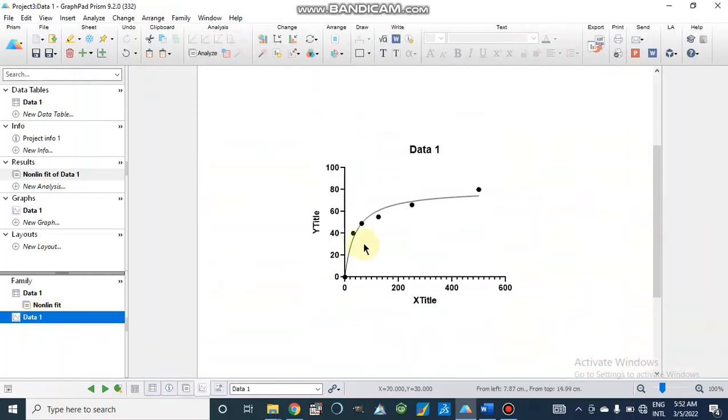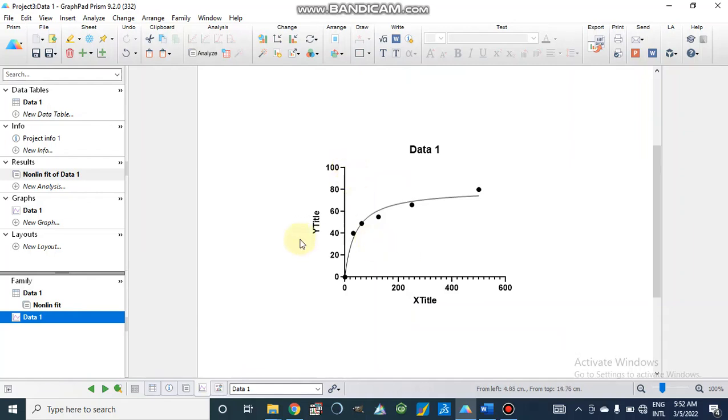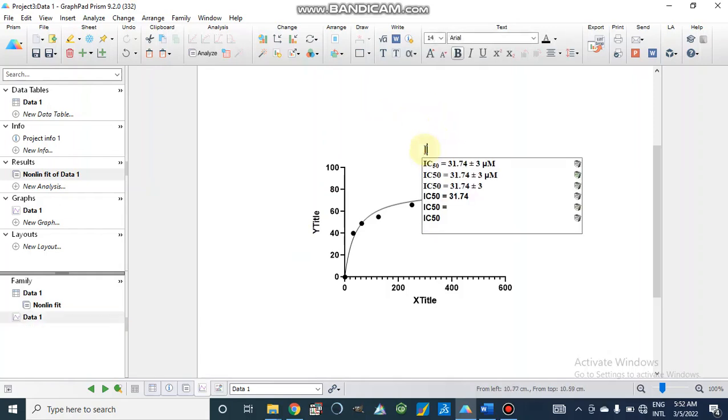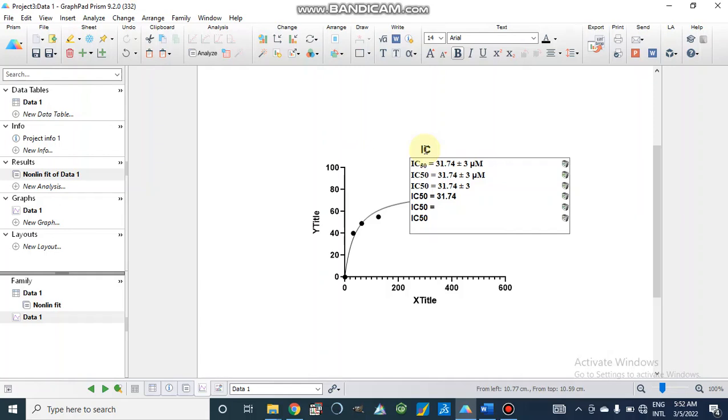If we go to graph it will be like this. Now this is our graph for IC50 values. We can manipulate our results. Like here I am going to make it IC50.